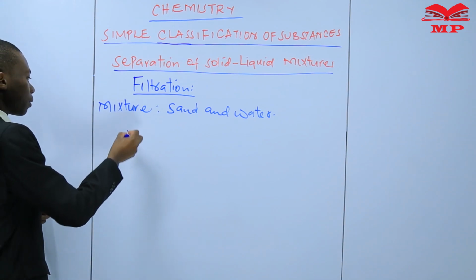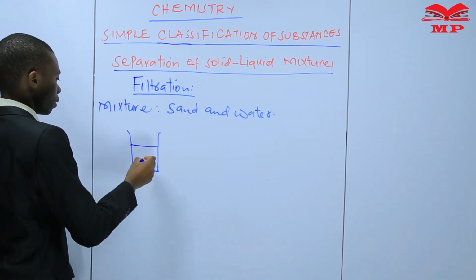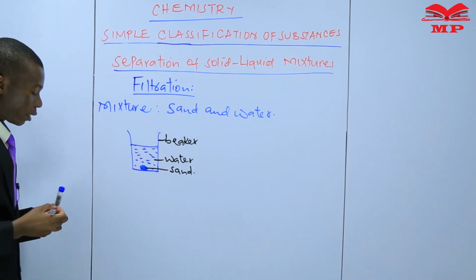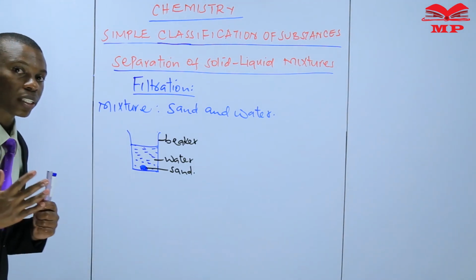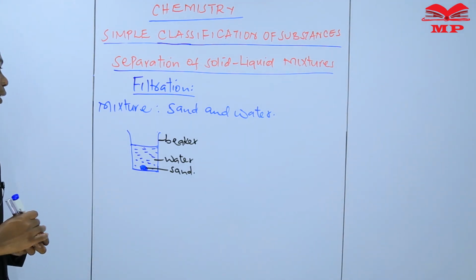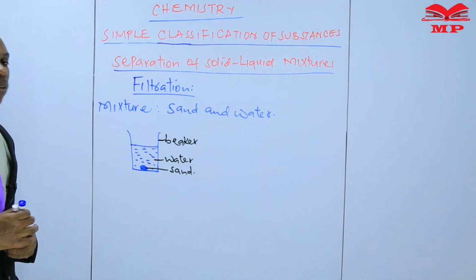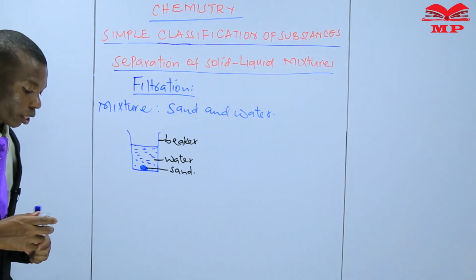But this is the mixture. We have the beaker. And that is the sand. So when you put sand in water, then sand does not dissolve in water, and therefore it settles at the bottom. And therefore, this is how we are going to carry out the filtration method.